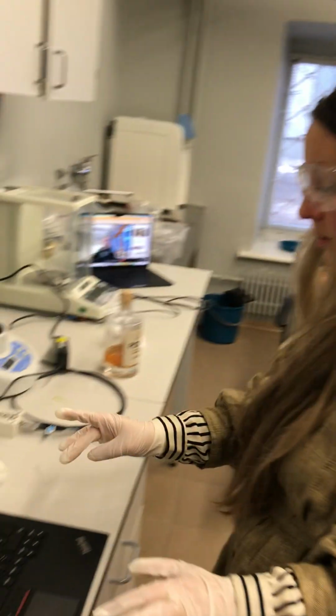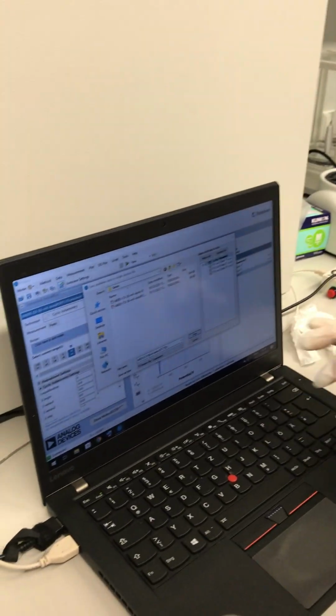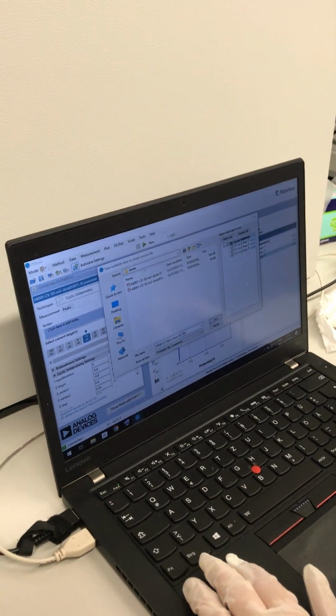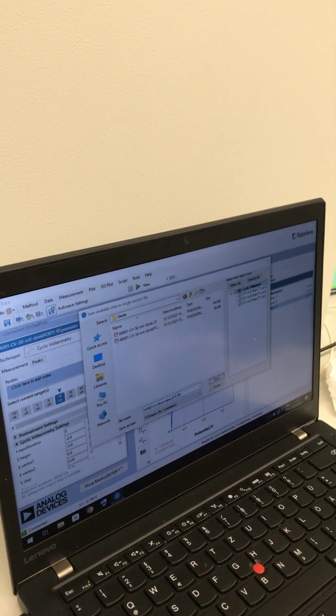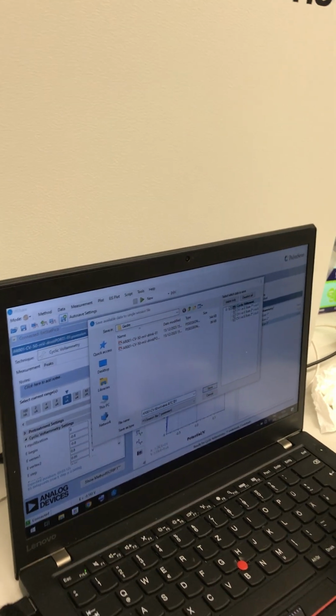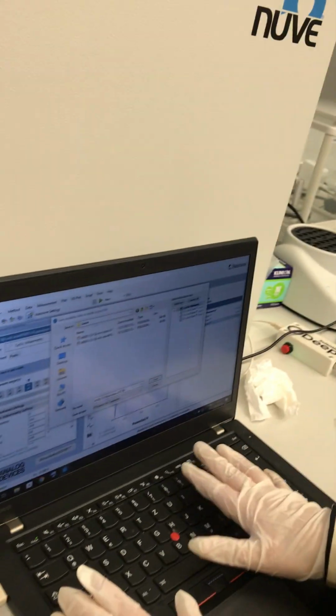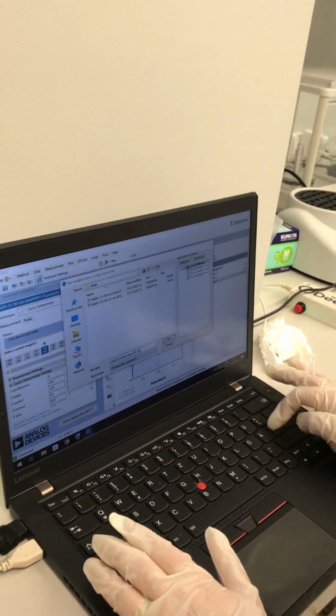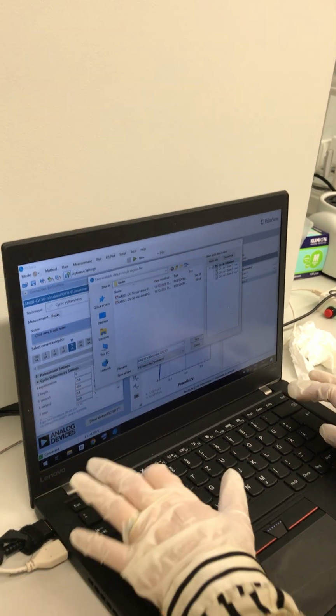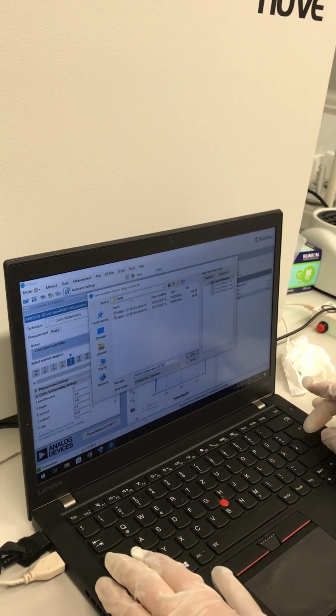Very good. Yeah, because it's important to label well, because when we analyze the data, I make the script to take the information from the name of the file itself. Oh, good. Where are you uploading it? She's just downloading into her computer, the software and the raw data files, to the laptop. Not to OneDrive.